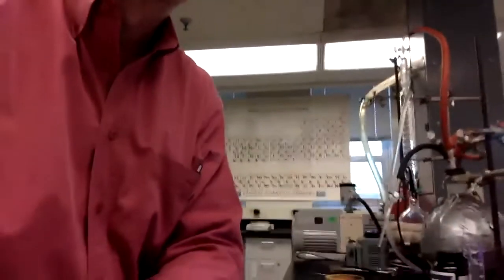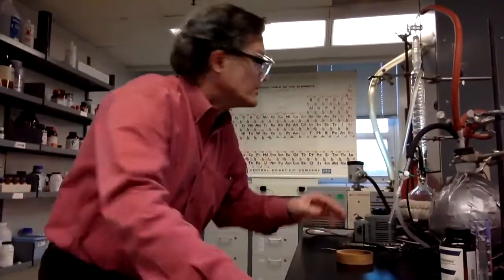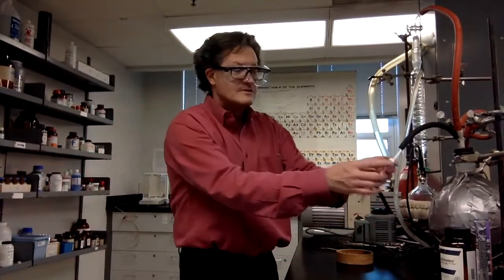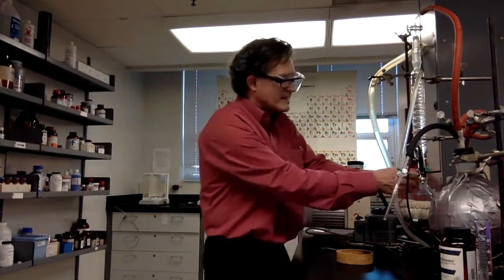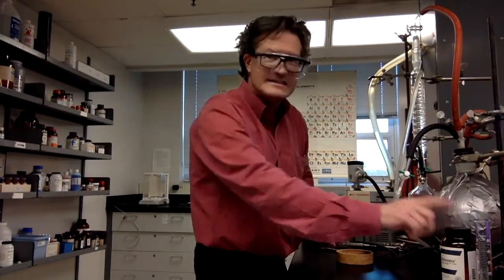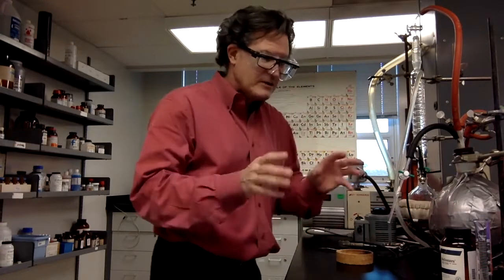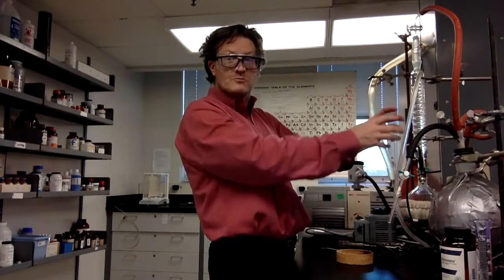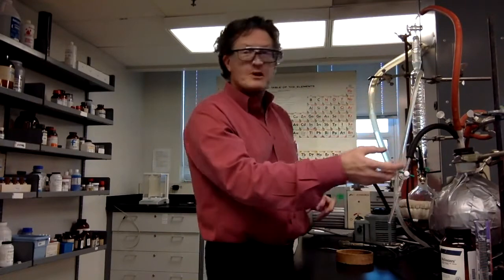We've controlled the pressure with the pump or letting gas in through the vent valve. We know how to control those valves, the two different types of valves we have, one without backlash, one with backlash. We know we've got a thin film of vacuum grease on there to make it seal, but we got to keep that clean. You don't get the dust in, we got to be careful about that. Get the system to equilibrate without blowing everything up through the top here. We have this valve open whenever this is hot so that we don't build up pressure there. We don't crank the pressure down and open that up very quickly to shoot stuff out the top there, and we don't over-pressurize the system.